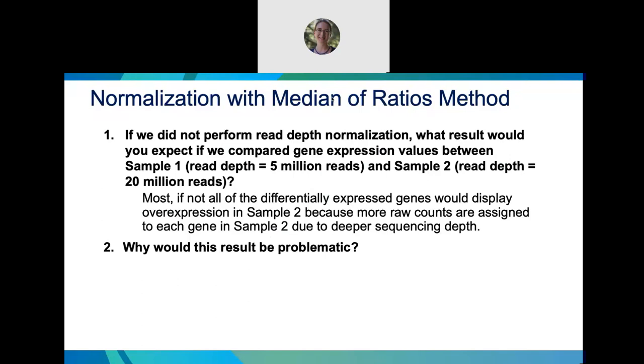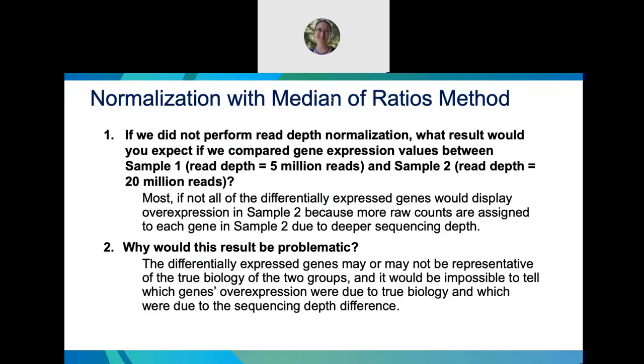Yeah, exactly, Eowyn. It's not providing an accurate picture of what's actually going on biologically. Which genes' overexpression is actually due to true biology and which are due to the sequencing depth difference. Yeah, exactly.